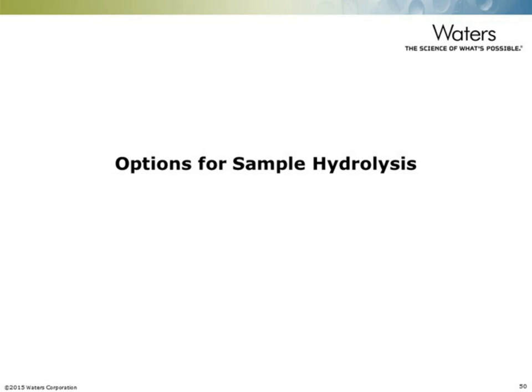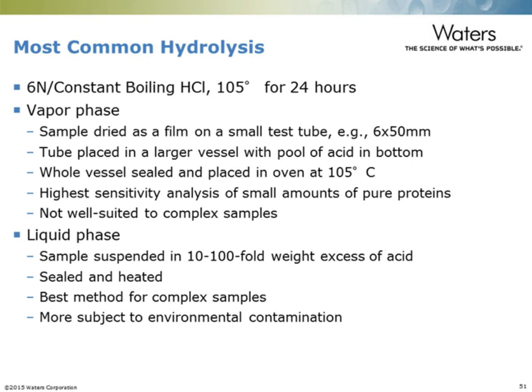As analytical methods improve and the throughput of the analysis has become better, the limiting step has become the hydrolysis of the pure proteins to prepare the sample for the analytical method. The hydrolysis itself is basically a technique that takes 24 hours.